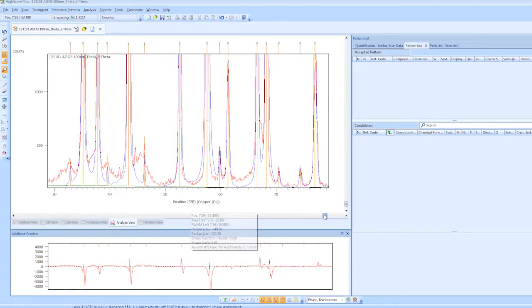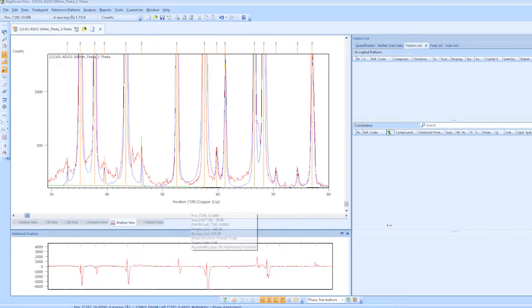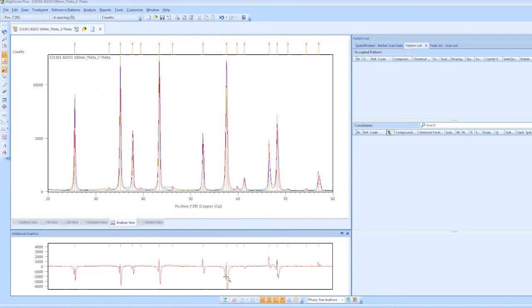And I think that's most of them. Yeah, there might be one right in here, but I'll hold off on that one, so I'll take that off. Okay, so now I'm going to zoom out. Okay, so I'm going to basically now perform the peak fitting.